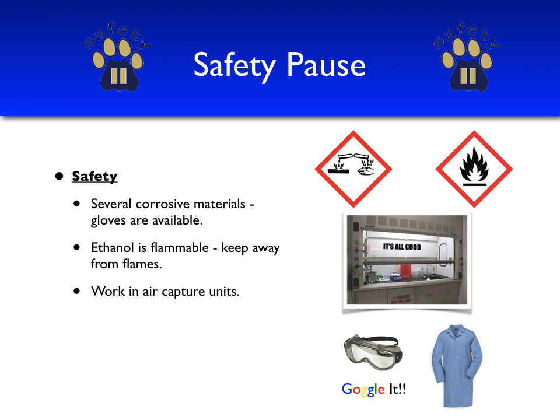Finally, there'll be several reactions where we'll be producing gases or heating up a substance. For these reactions, we'll work in the air capture units. For waste disposal, we'll be collecting all waste for this experiment in a specially designated waste bottle. No reagents will be poured down the drain. And of course, we'll wear our PPE. We'll goggle up, and we're going to wear a flame-resistant lab coat.